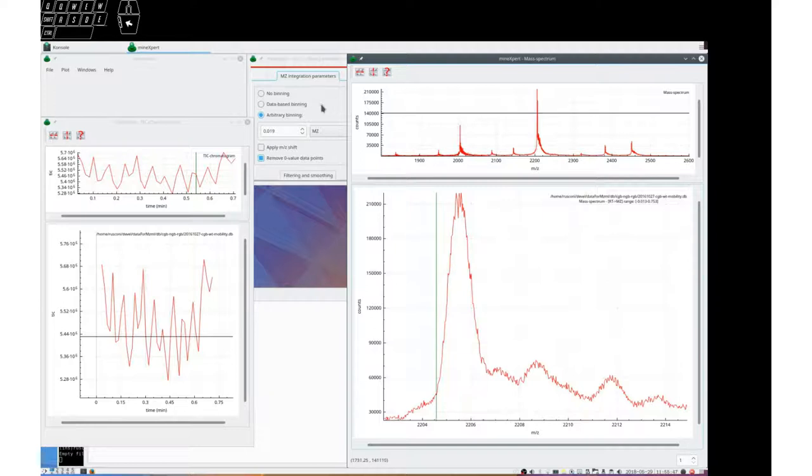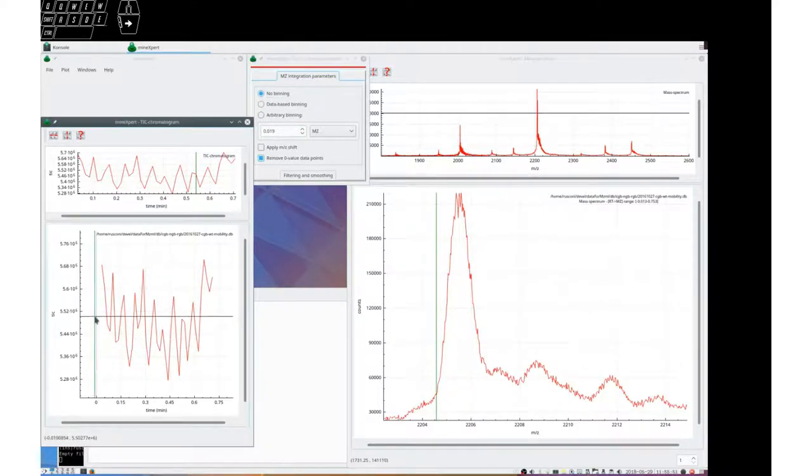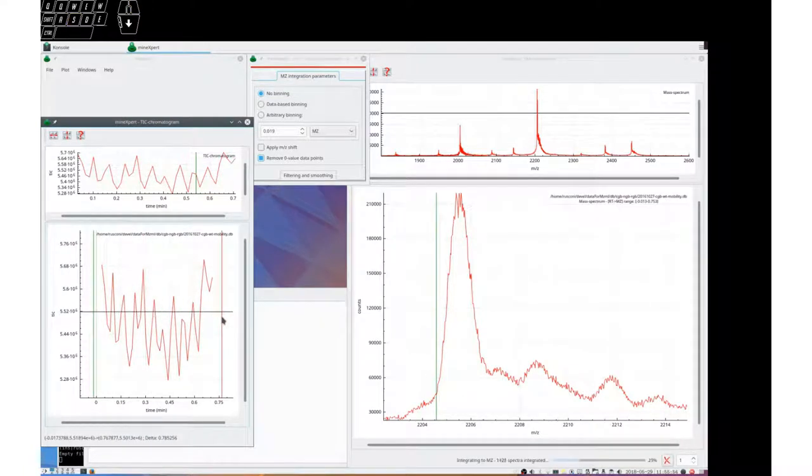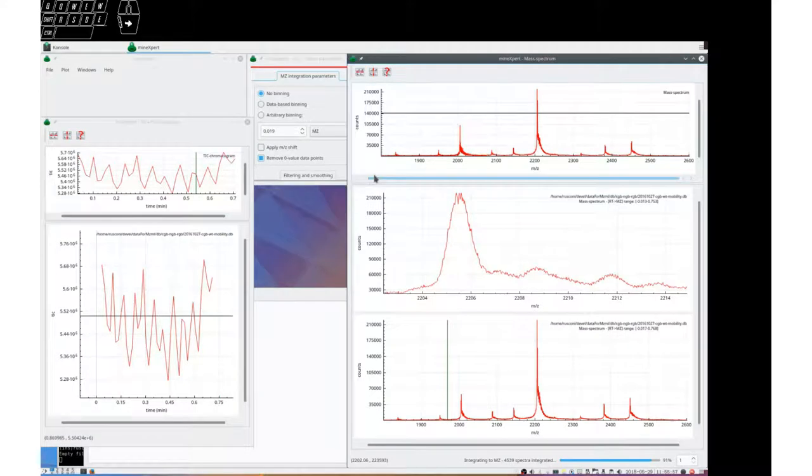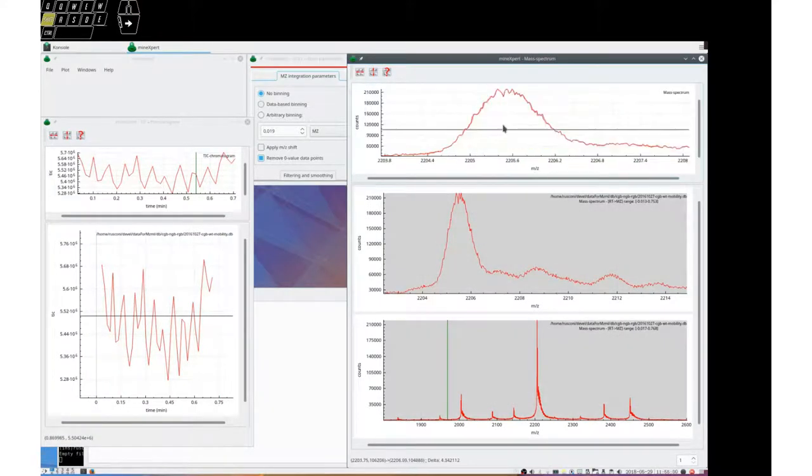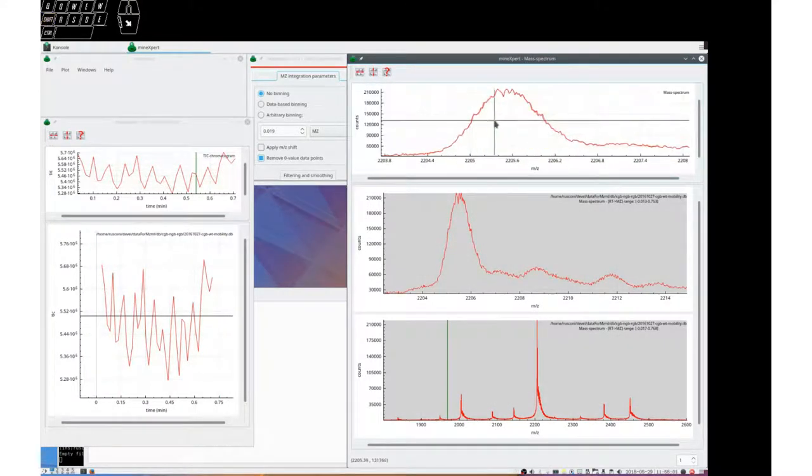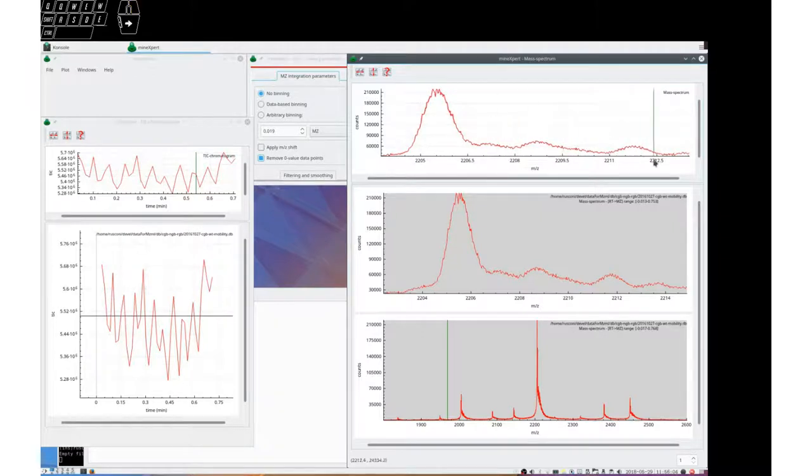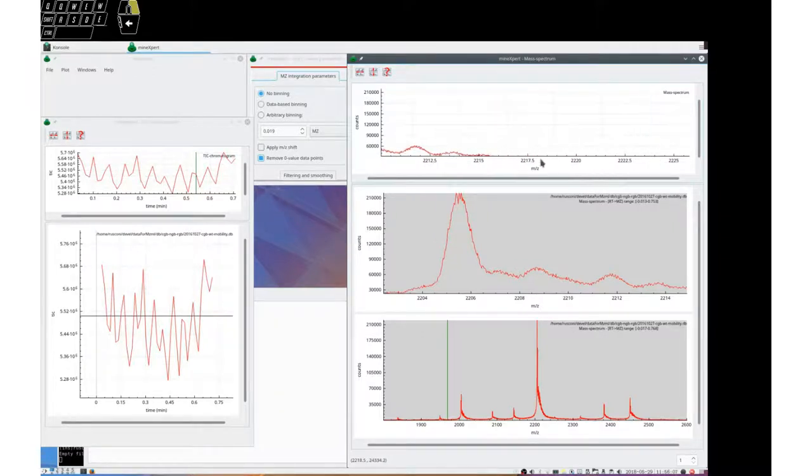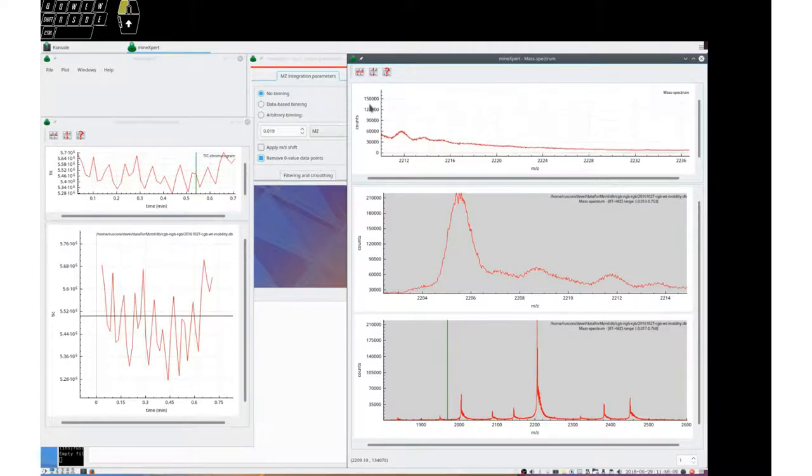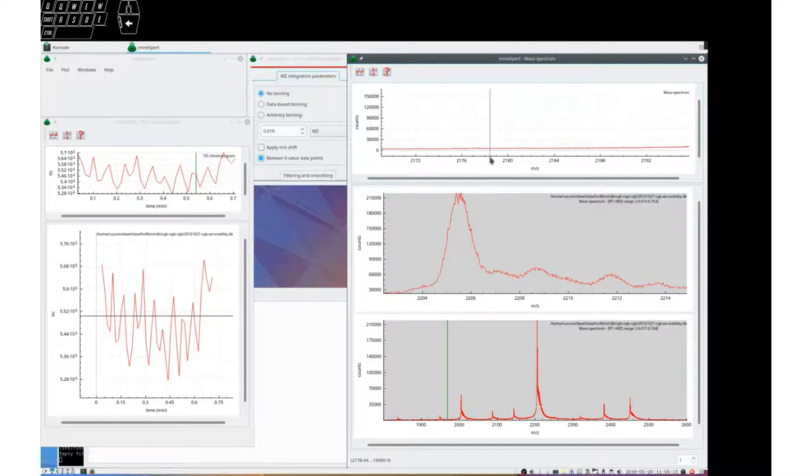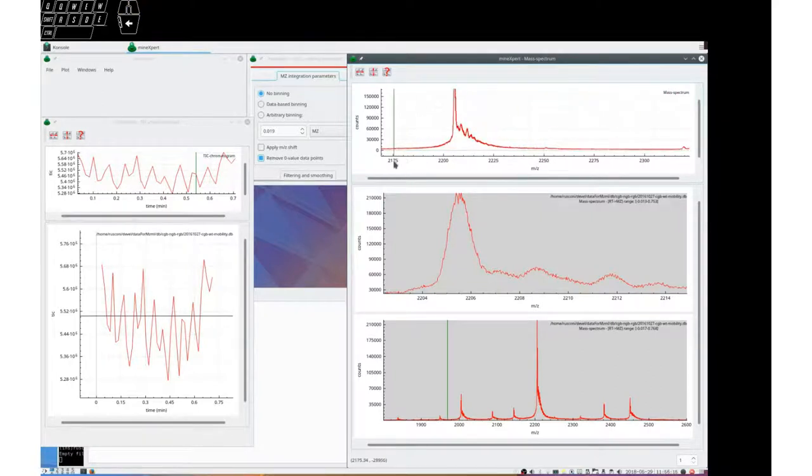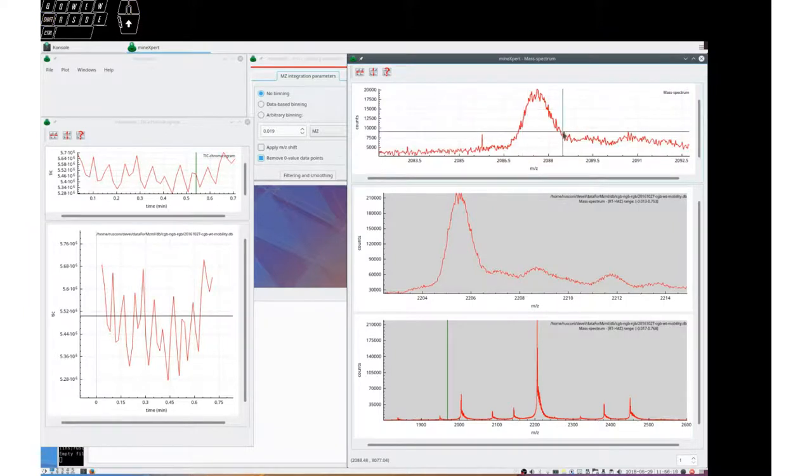We can ask that no binning be performed. Let's do that same integration again. And we will see that the result is roughly the same, as you can see. If we look at different parts of the spectrum, we can see that the spectra are almost superimposable.